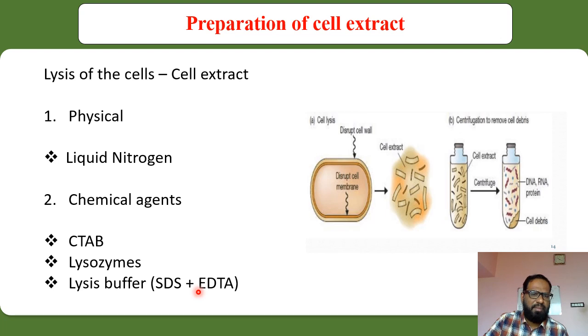If you are working on animal cells, maybe from WBCs or from some other cells, maybe from epithelial cells, maybe from hair follicles, you prefer this technique, which we call the lysis buffer. The lysis buffer only has two chemicals. One is SDS, the second one is EDTA. Both of them are very important chemicals mainly responsible for the disruption of the cell membrane. What does the SDS do?